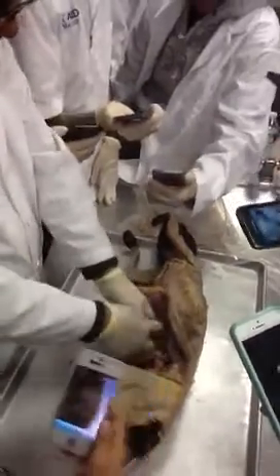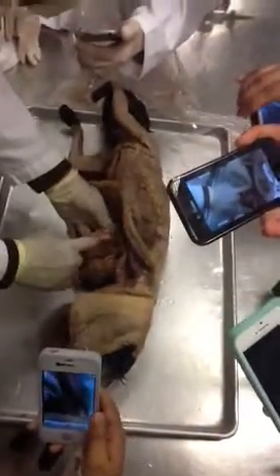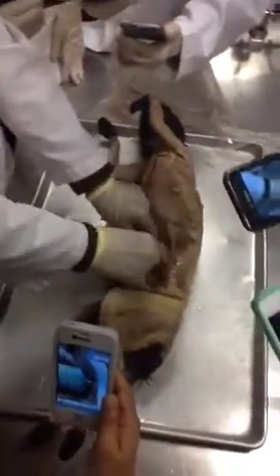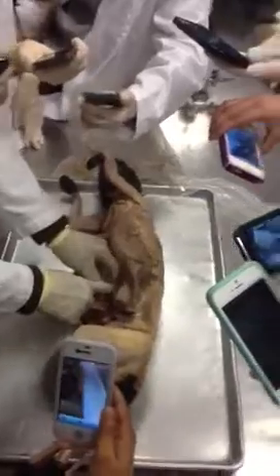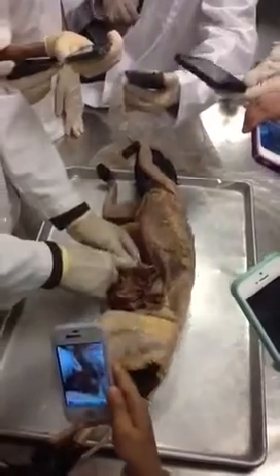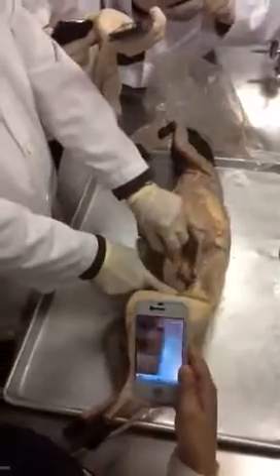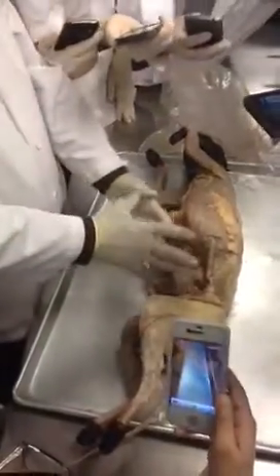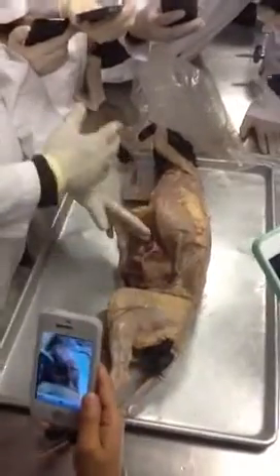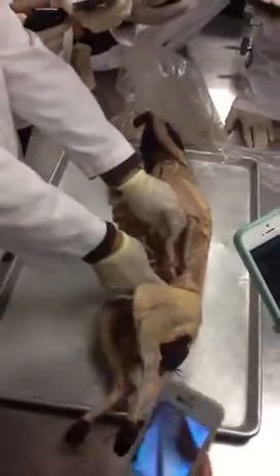And when the small intestine goes inside the large intestine, this portion must be ileum, and jejunum somewhere in the middle. Alright? So the initial portion of the large gut is called cecum. Then you can see the appendix here, the cat appendix. And this is the large gut. It doesn't have that many things like us, ascending colon, descending colon. So we will call it large gut, and the large gut will become the rectum, then the anal canal, and it will go out.